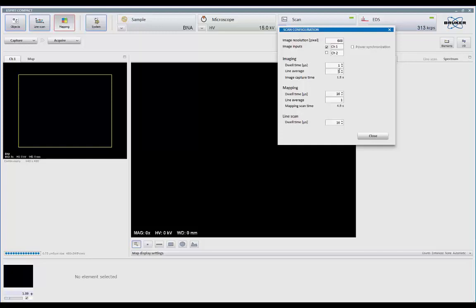You have separate controls for pixel, line, and frame averaging for imaging and mapping. And you have a separate control for dwell, or pixel averaging, on line scans.